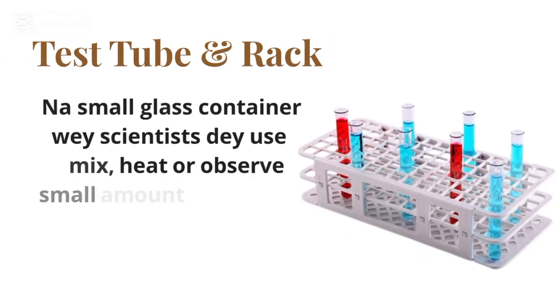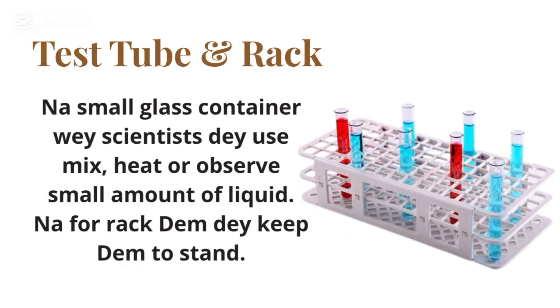The first one na test tube. You see this small container wey you dey see so? Na big boy for lab. Dem dey use am carry out small experiment dem. E fit hold small amount of water or any other liquid. You see that thing wey dem use put am, na wetin dem dey call test tube rack. Na there wey dem dey keep am, whether when dem wan put am inside water bottle or when dem wan just keep am make the thing dey safe.